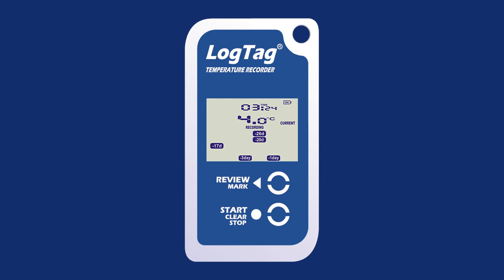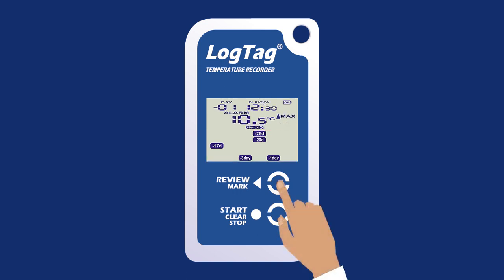Once the logger has been logging for several days, the days where alarm excursions occurred will display at the bottom of the screen. Press the Review Mark button to enter the statistical review. The maximum statistic will display first. Press the Review Mark button to view the minimum statistic. Continue to press the Review Mark button to work through the days where an alarm excursion occurred.